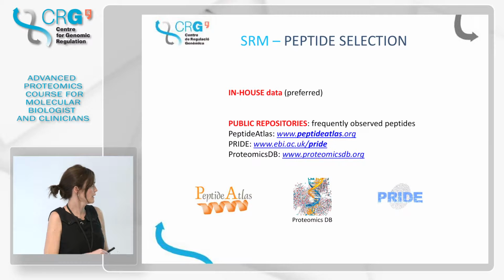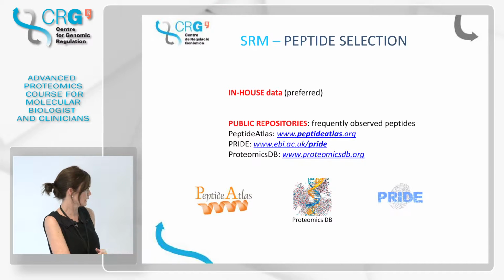So in general, it's preferred to use your own data. If you don't have any, you can go to public repositories where there is mass spectrometry data. There are MS2 spectra. You can see which peptides have been most frequently observed, and from those you can look at their fragmentation pattern and decide, okay, this one can fit. Here are some examples of these repositories.